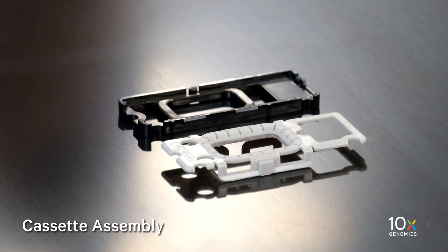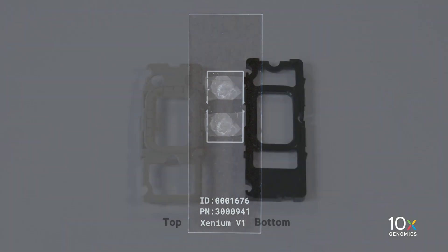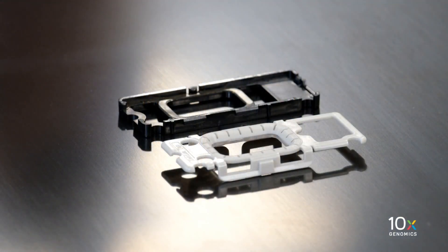First, we will demonstrate the Xenium cassette assembly. We have tissue in the imageable area on the slide. The slide has previously been prepared as part of the Xenium workflow. The Xenium cassette consists of two pieces, the top and bottom of the cassette. Place the top and bottom halves of the cassette on the bench.